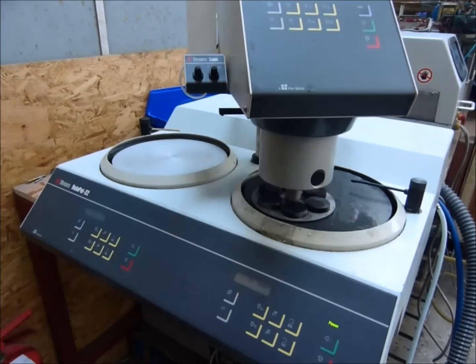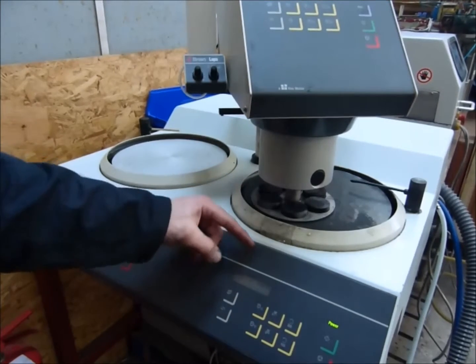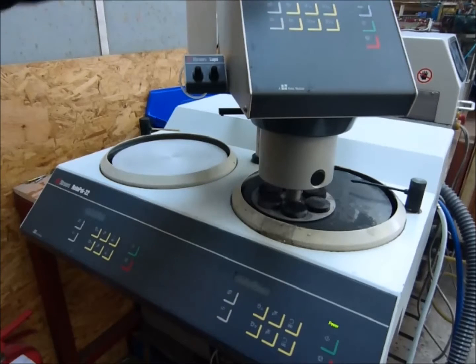It's set for grinding. The water's turned on, set at 300 RPM, and the force is set to 30. You can adjust the parameters to your liking, and you can also set the time of grinding.